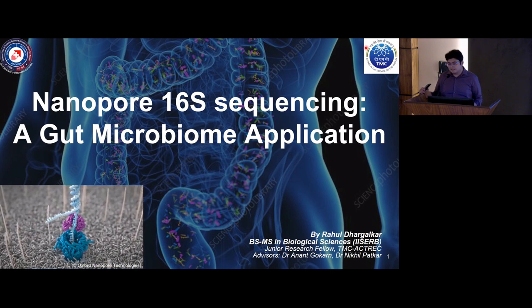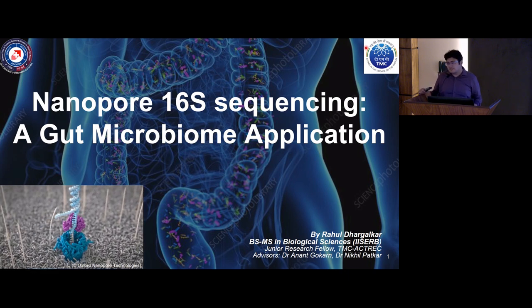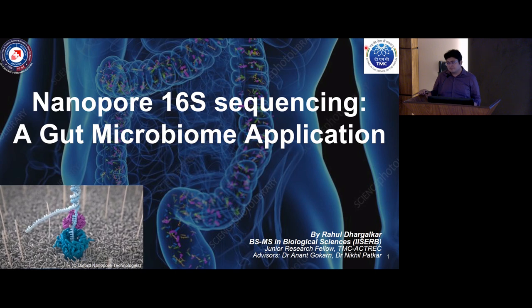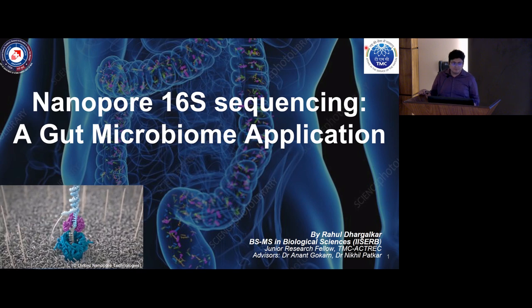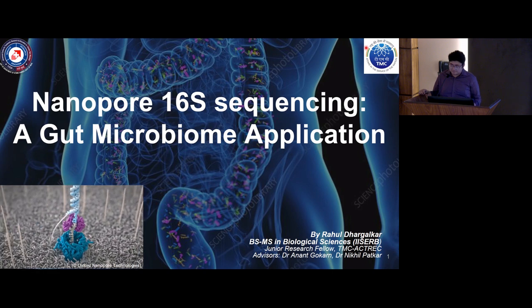You remove it from the flow cell, put it in the fridge, remove it 4 months later, and still use the flow cell, with the remaining things cleared using a wash kit. So this is absolutely spectacular, where you don't have to actually exhaust the whole flow cell. You can keep using it, washing and using, washing and using.